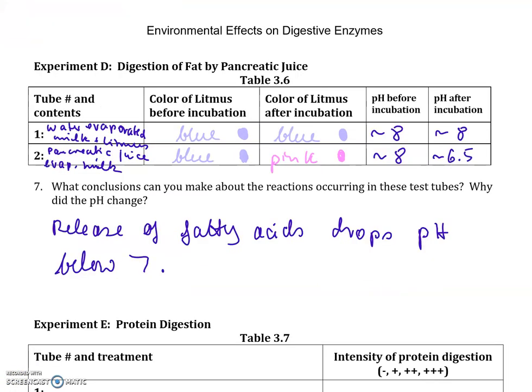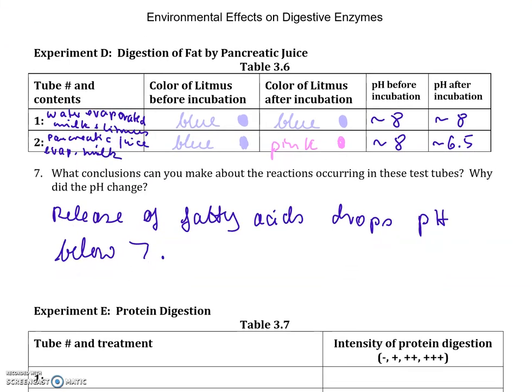Moving on to experiment D: the digestion of fat by pancreatic juice. In pancreatic juice we have the enzyme lipase, which will digest fat. We're using extra-fat evaporated milk, which has about 30% fat. Test tube number 1 contains water, evaporated milk, and the litmus reagent, and we're going to add sodium hydroxide to both test tubes to bring the pH to about 8 before incubation.